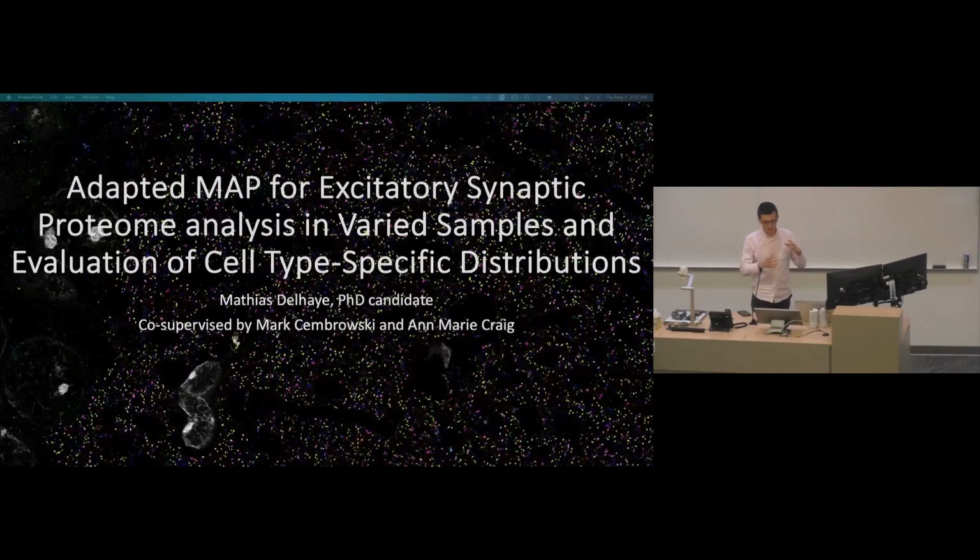I'm going to talk to you about the first part of my work during my PhD, which was to really troubleshoot the MAP, the magnified analysis of the proteome, that Kaylee used, and also Bettina is using in her workflow.